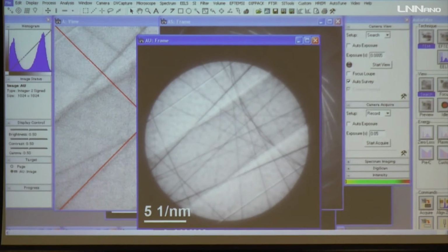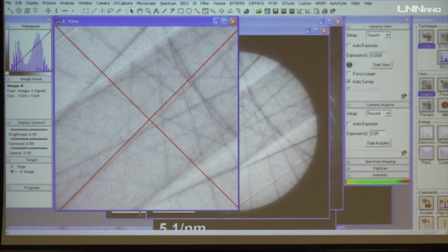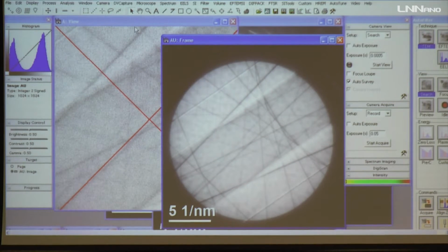This is a very good zone axis. The reason I say so is that, from working on the image, I know the silicon germanium bands are parallel to this red line. So this zone axis has both the Holz lines oriented parallel to the zone axis and perpendicular to the silicon germanium layers. So I can show you some interesting details now. I don't want to change and click around the sample now. I will try to show you the variant techniques of CBED.